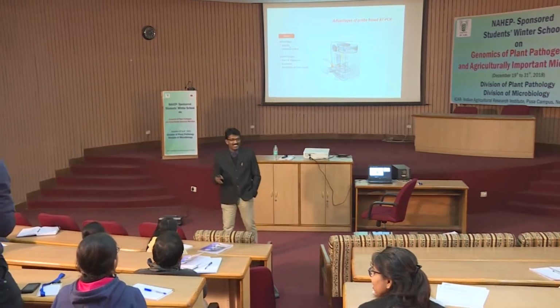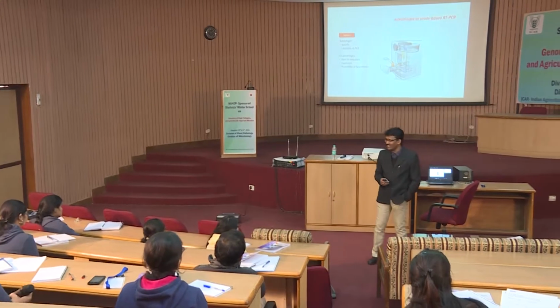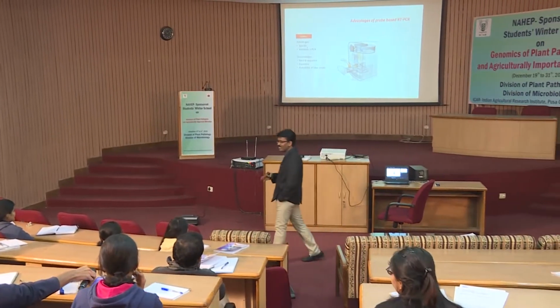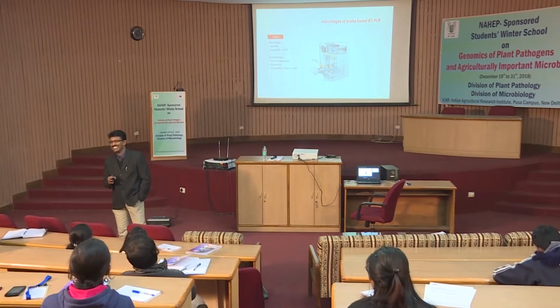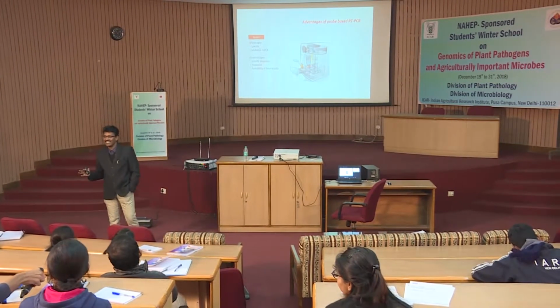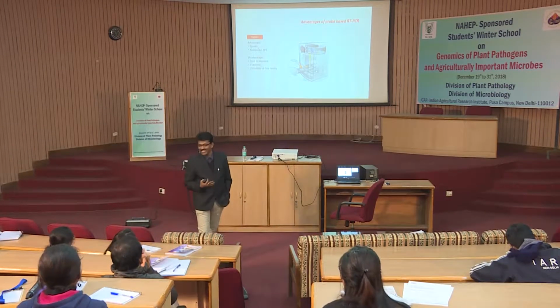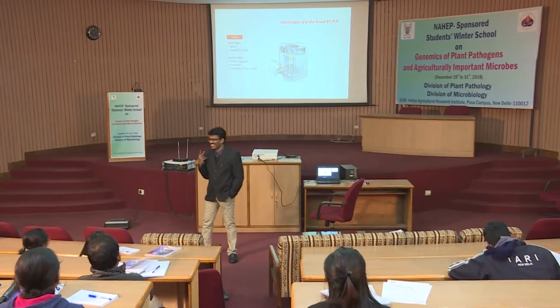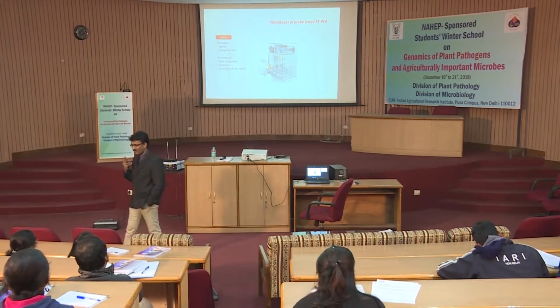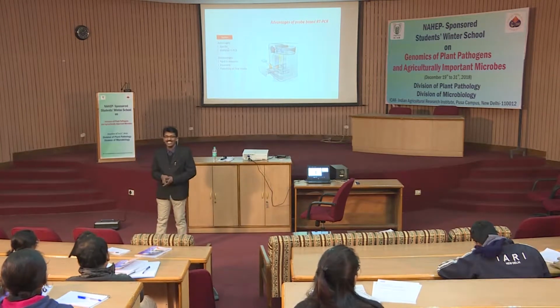Okay, rightly told. So, that is an extra step you may have to do. That is the reason why people are so comfortable with SYBR Green based qPCR, hassle free, right. But here, you have to go for two times primer designing, correct. Probe designing is also much similar to primer designing only.